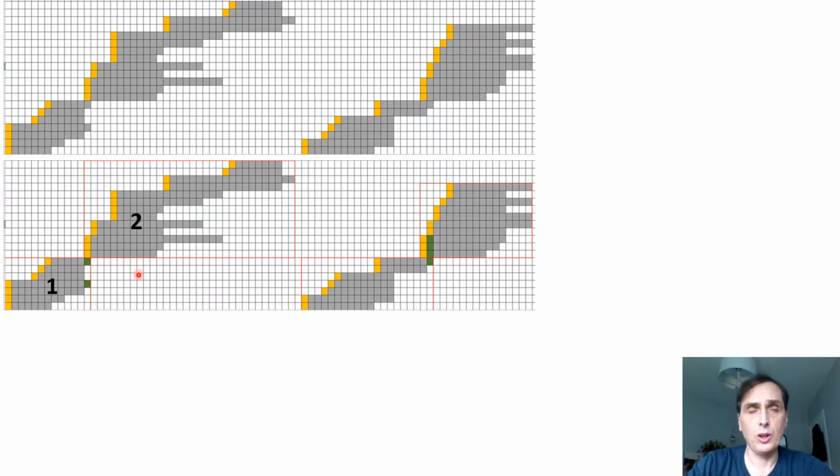And that's because although these two subsections do overlap with each other here, the overlap actually contains N-terminal peptides, which are coloured in this sort of orange colour. And N-terminal peptides are considered blanks for the optimization, and so these two regions do not actually overlap, and so we can create subsections naturally there.